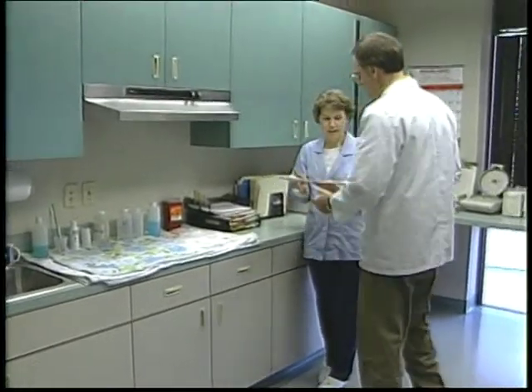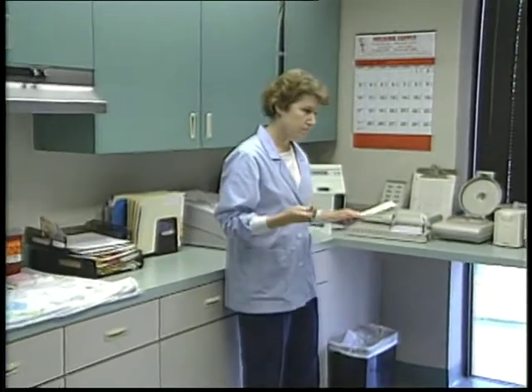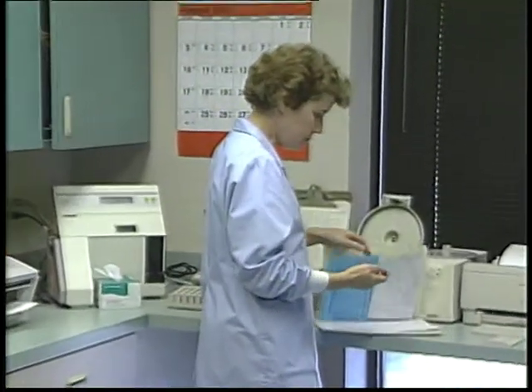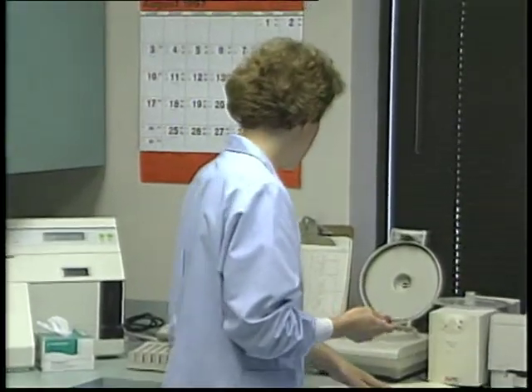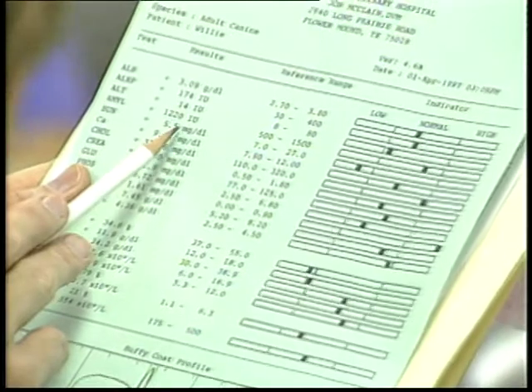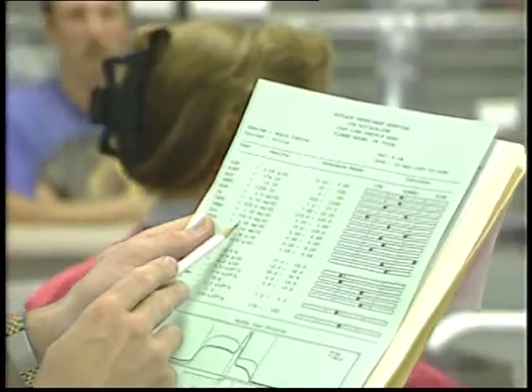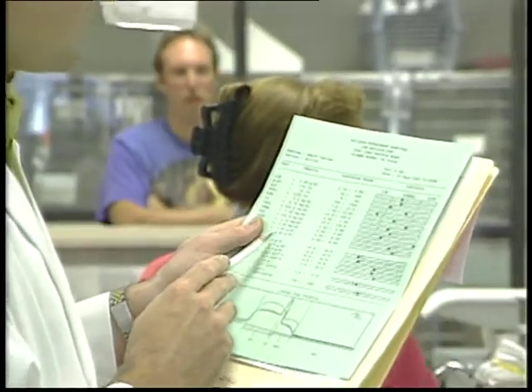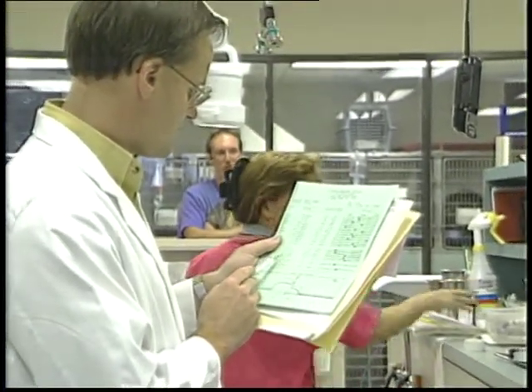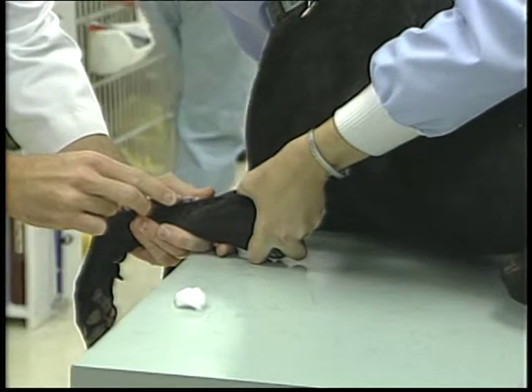You play a valuable part in this detective work by accurately conducting these tests. Your role is to understand how to perform the tests, while the veterinarian's role is to apply their many years of training and experience into interpreting the results. This program does not attempt to train you in interpreting the results, only proficiency in running the tests. Together with the veterinarian, you will be helping to diagnose diseases, many of which can be effectively treated.